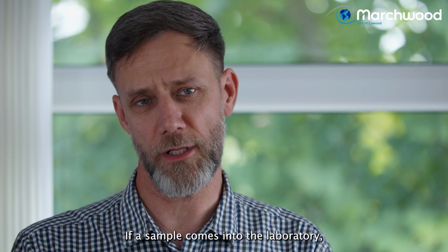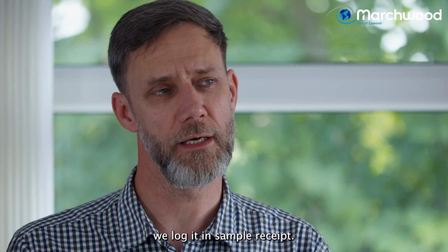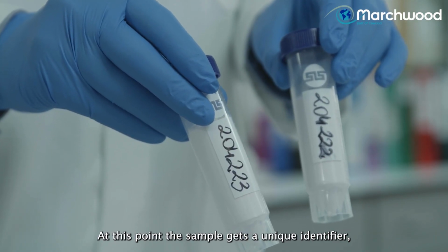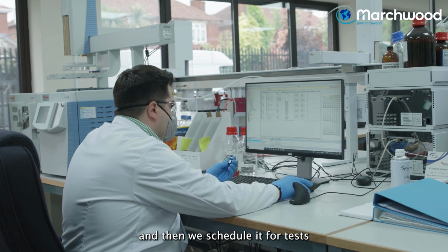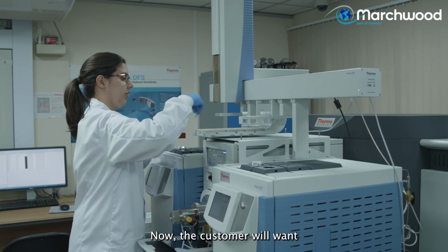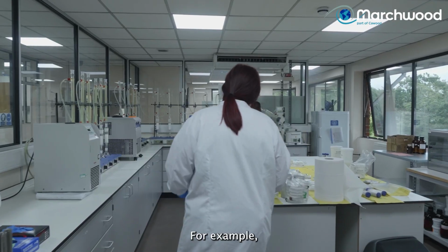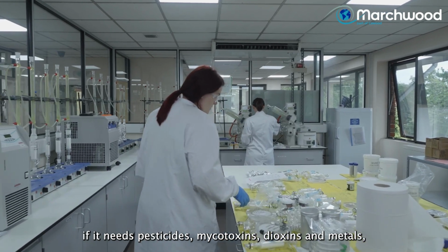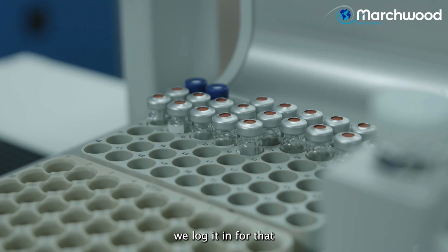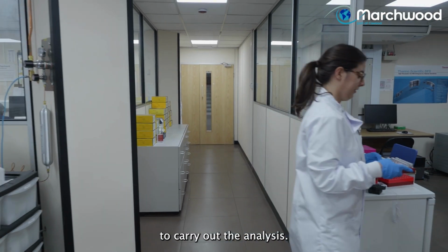If a sample comes into the laboratory, we first of all log it in sample receipt, and at this point the sample gets a unique identifier, a unique reference number, and then we schedule it for tests based on what the customer wants. Now the customer will want testing on this sample due to current legislation. So for example, if it needs pesticides, mycotoxins, dioxins and metals, we log it in for that. And then the sample gets split off and it goes to the separate laboratories to carry out the analysis.